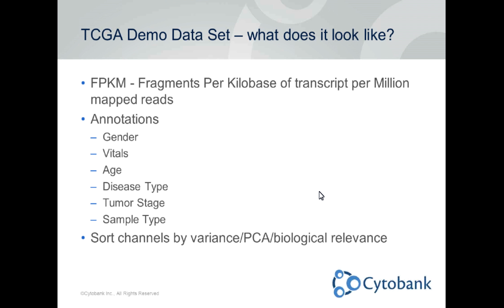However, if you would like to use a different method, like PCA, principal component analysis, that's a very viable way to reduce the number of channels in your data set to just the ones that contribute most to the change between your samples. However, if you do that, you might not be including channels that you care about. For instance, if you care about Tregs or immunotherapy, you might really be interested in looking at PD1 or FOXP3 or these other things.